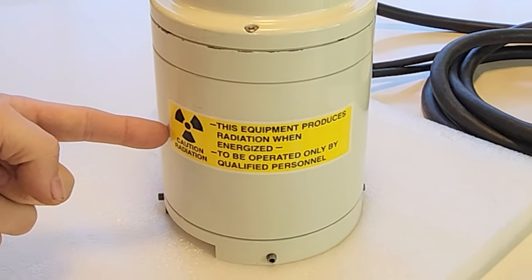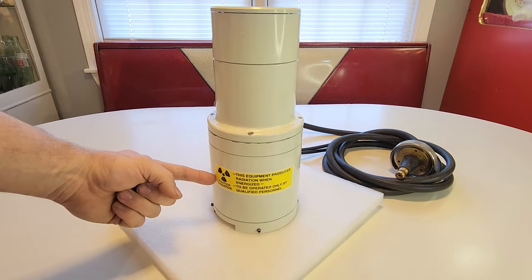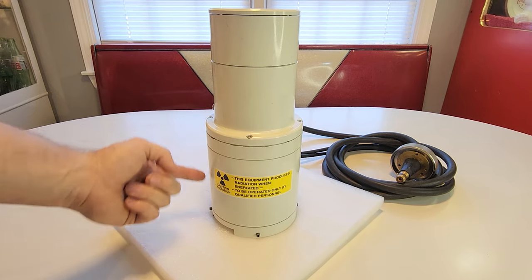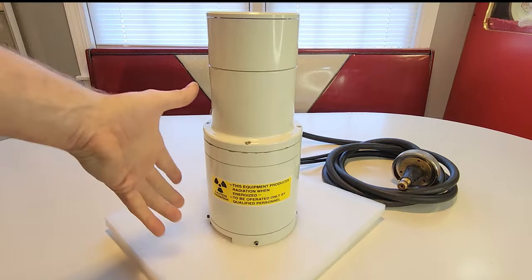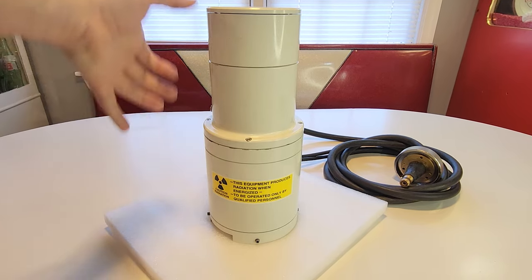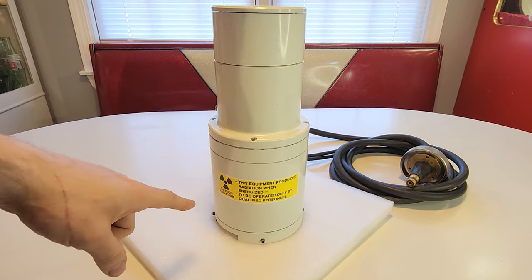Hi, Doug here. Judging by this sticker right here, we have an exciting teardown today. This is the top half of a scanning electron microscope — it's basically the world's most overbuilt CRT electron projector gun, and we're going to explore it today.